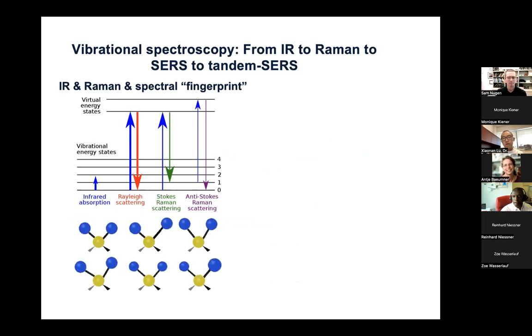So both infrared and Raman belong to vibrational spectroscopy. As you may know, molecules have different vibrational modes in the environment. So for example, stretching, wagging, etc. And there will be some interaction between the laser introduced from the equipment and the molecules. So this interaction will generate a different type of spectroscopy model. For the IR, we call this absorption, and for Raman, we call this scattering. So that's the major difference between infrared and Raman, because IR is for absorption and Raman is for scattering.